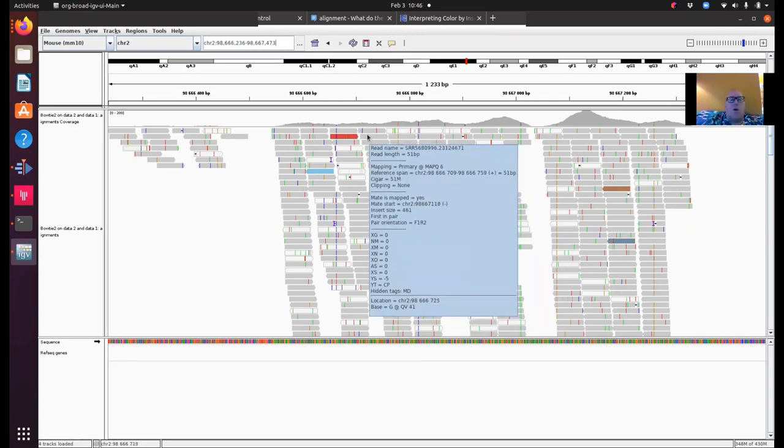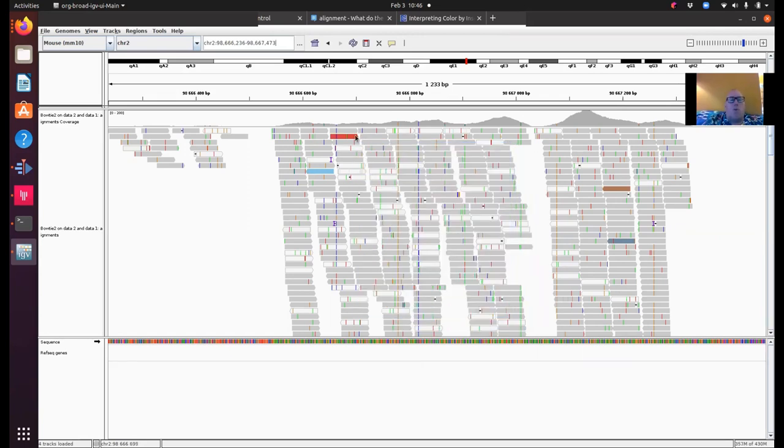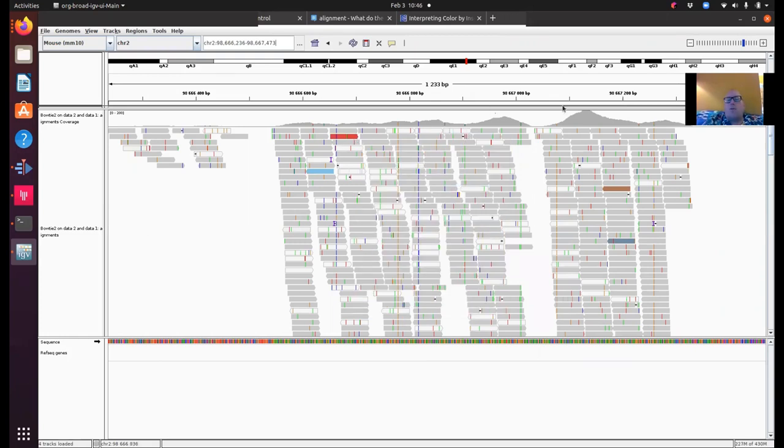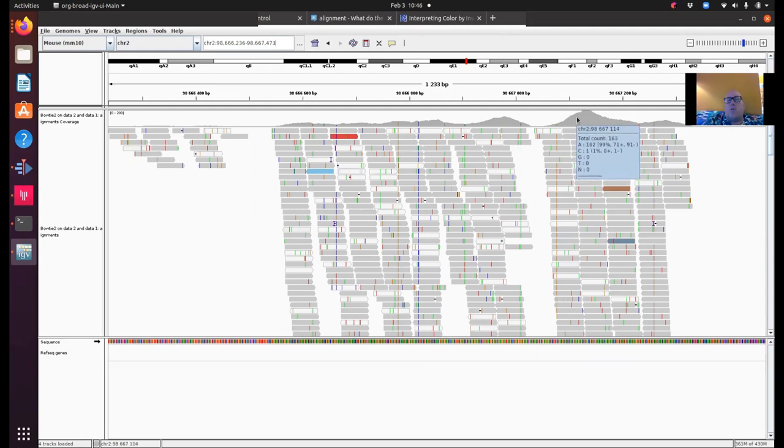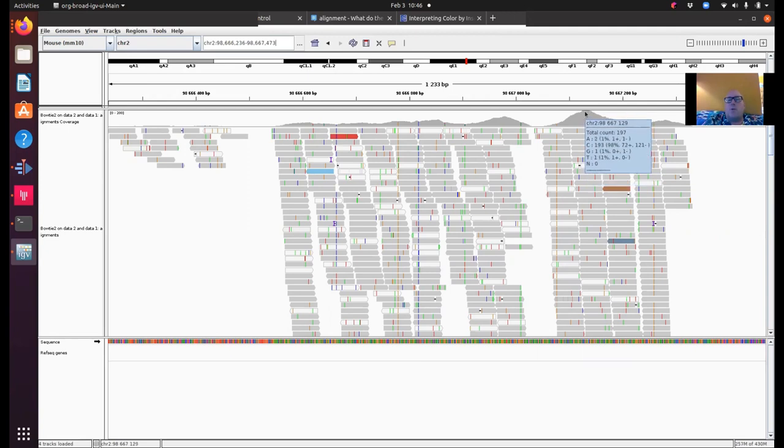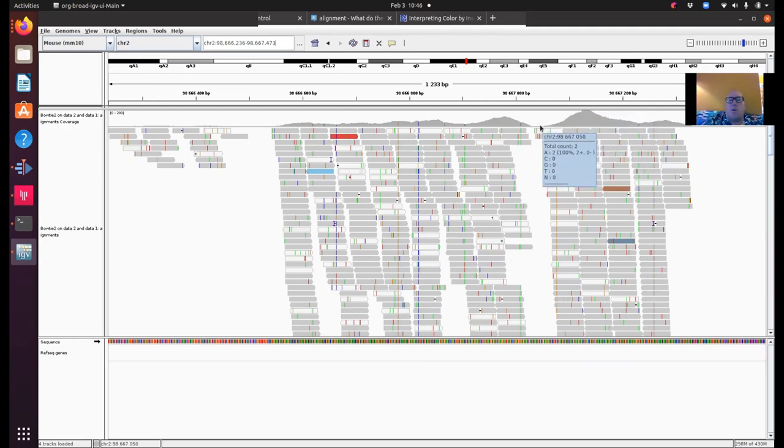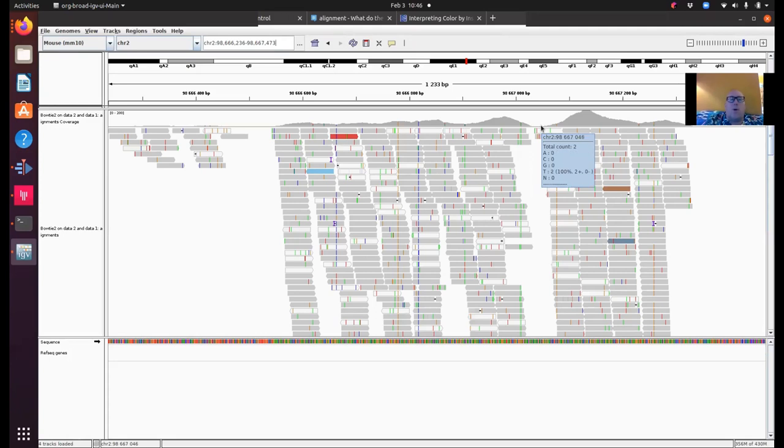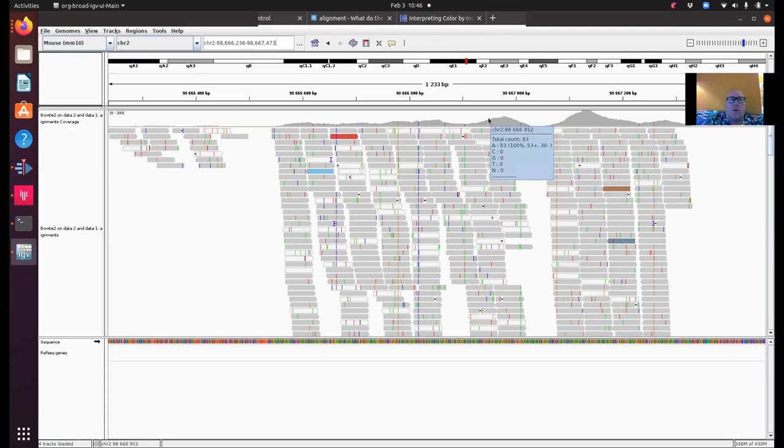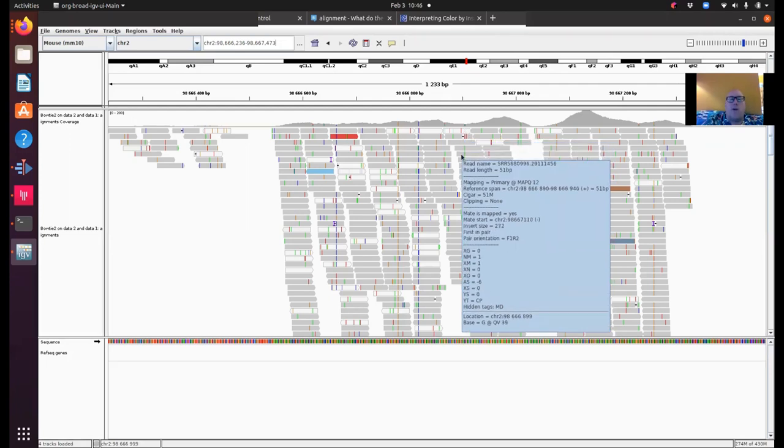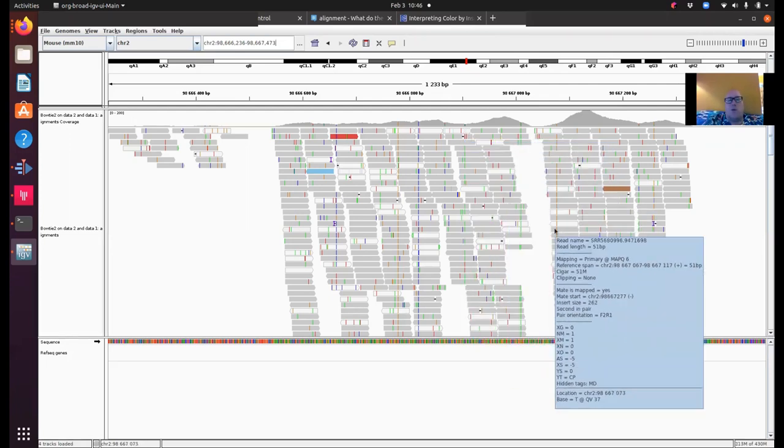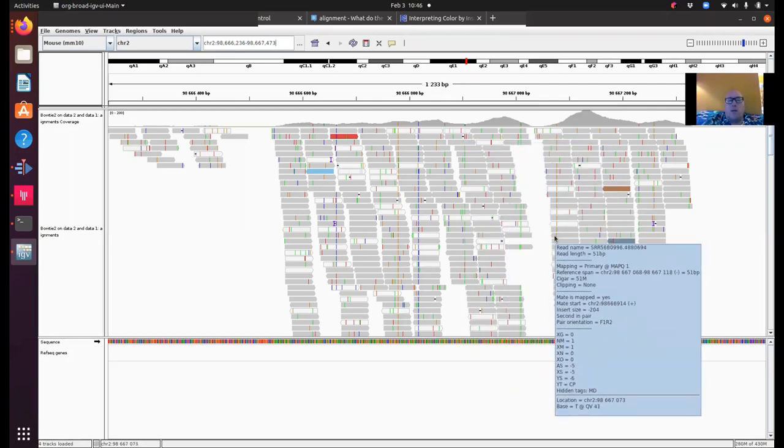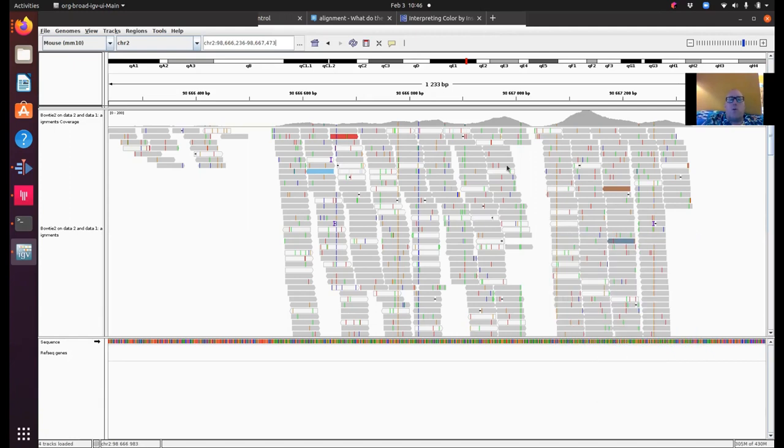And this graph at the top here is a graph of depth of coverage. So we can see here peak coverage is about 200 in this position and dropping down to nothing here. It's very difficult to say anything about this coverage because we have such a small sample. But we often do look at a graph like this to see whether we actually have enough reads in a region in order to realistically detect variants.